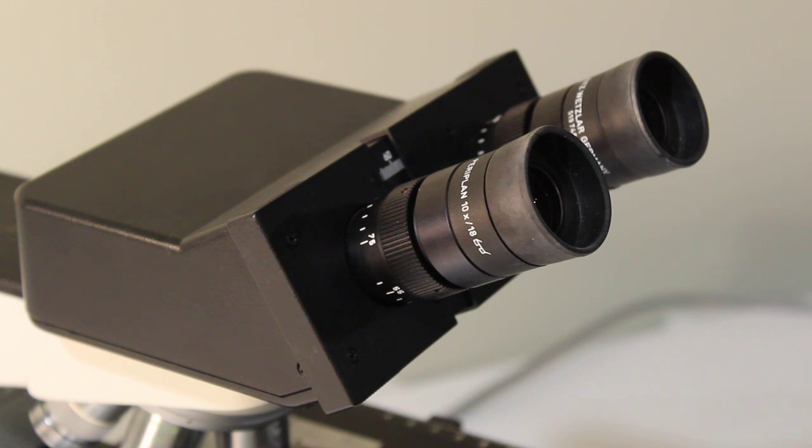The last component of your microscope's optical system are the oculars or the eyepieces, the things that you actually look through. These do two different things.